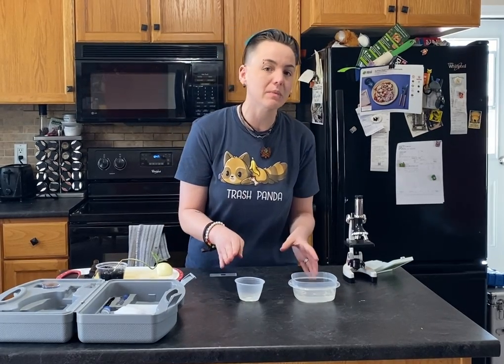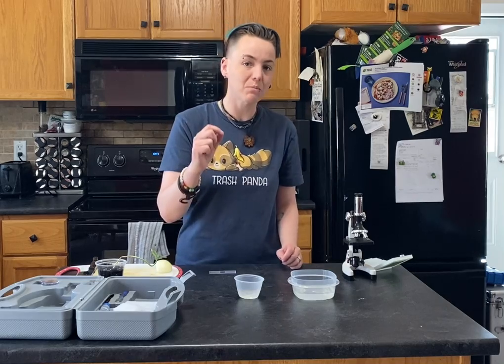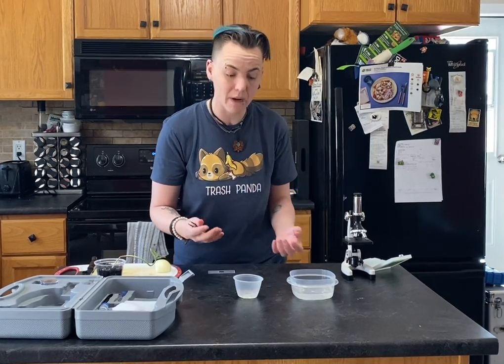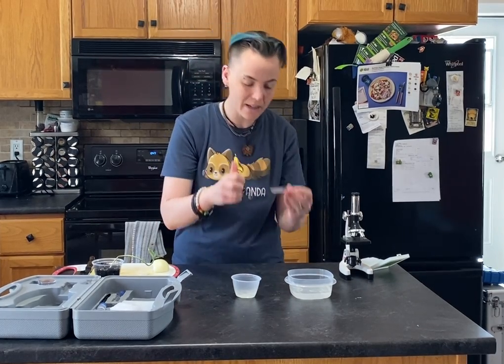I want you to leave them like this for several hours. Then what you're going to do is the exact same prep that we did when we first learned how to use a microscope — we're going to use the onion skin slide prep. So we have a slide here.